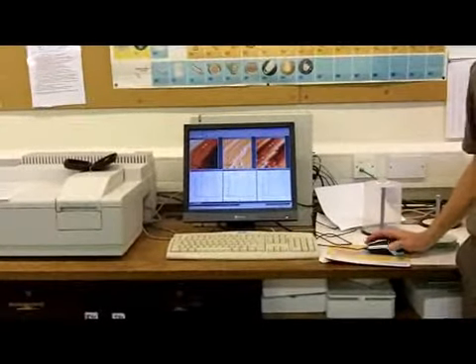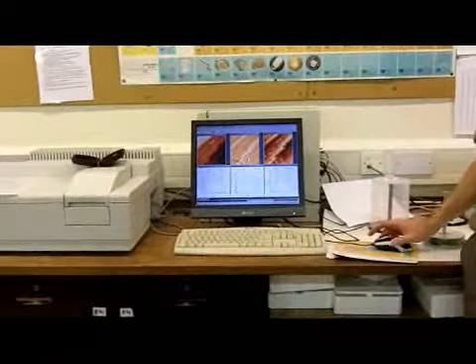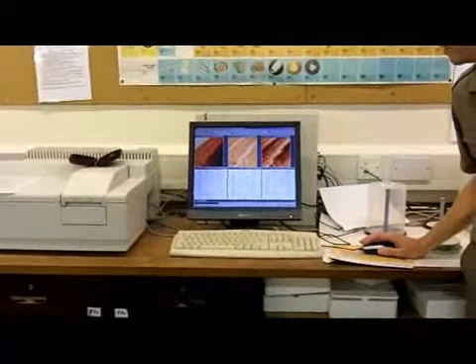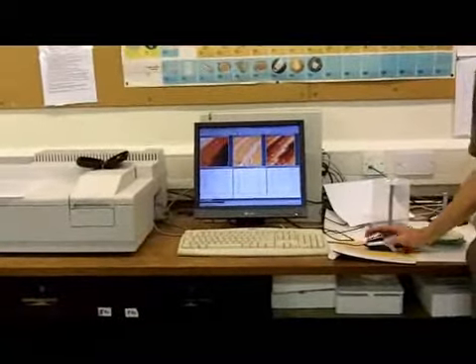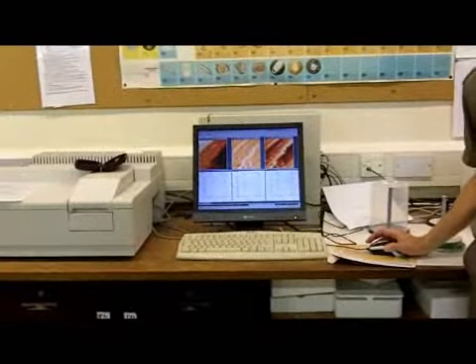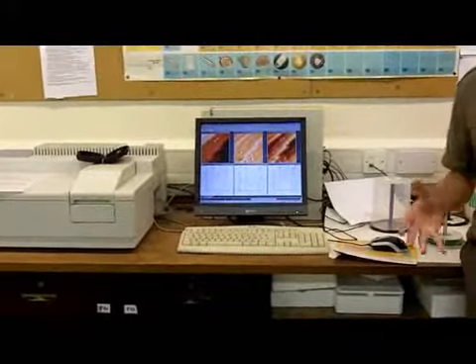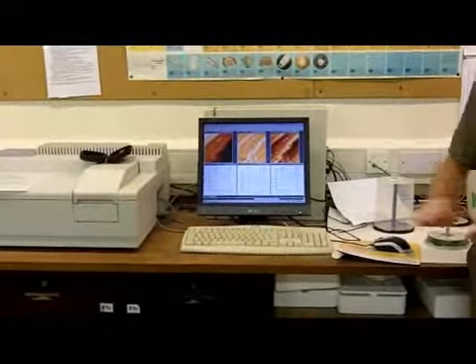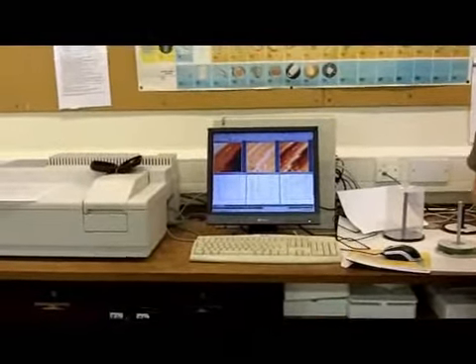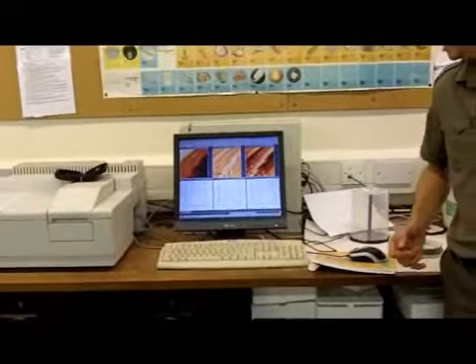Right, so once we've got these images, now what we want to do is transfer them to a report, which you're probably going to write in PowerPoint or in Word. For the images, it's fairly straightforward. We click on the image we want, and there's a copy button up here. Copy and paste, and it will go in, and the profile will be there as well. For the profile itself, it's slightly more tricky, but very slightly. When we copy and paste, what it copies are the numbers. So it copies a table of spacings, of distance against height. So paste that into Excel and plot it through Excel, and I find that better anyway, because then I can control what the plot is going to look like.